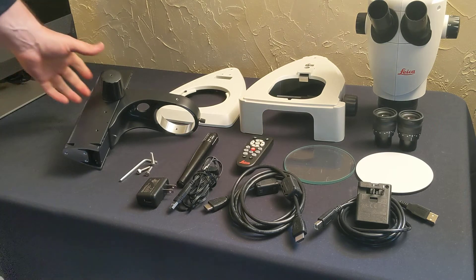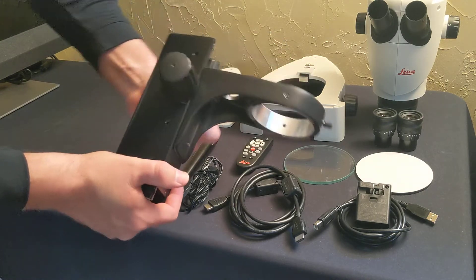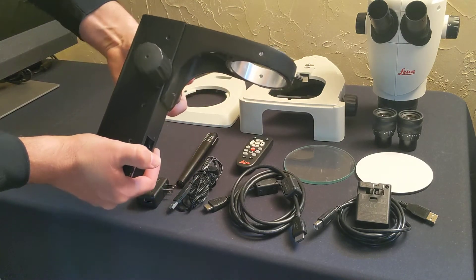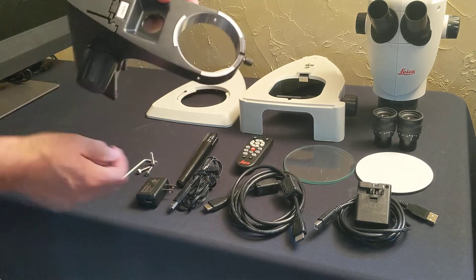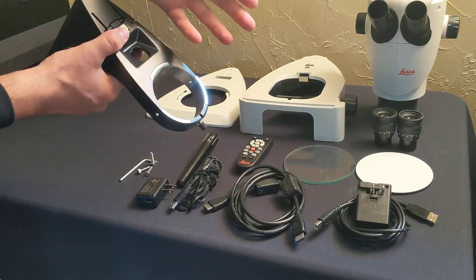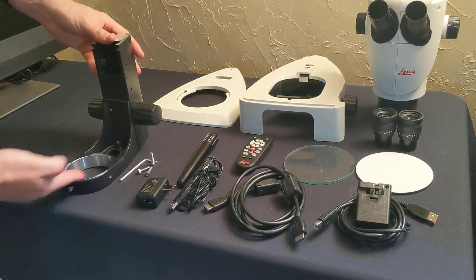So let's go through some assembly. First, take the focus column and drive it all the way up to the top so that it's flush. Loosen the thumb screw so that this is smooth for the microscope to slide right into there. Now that this is flush, you can place it upside down so that this is facing you.